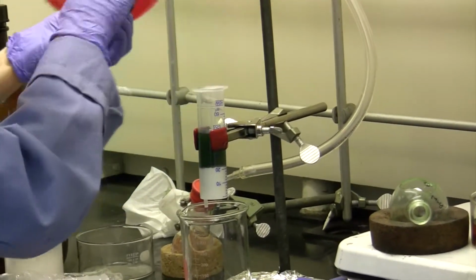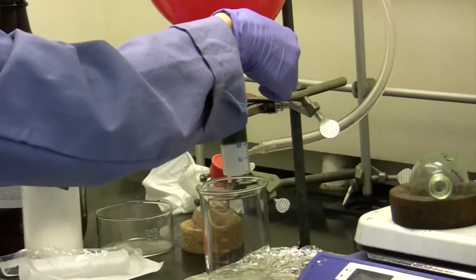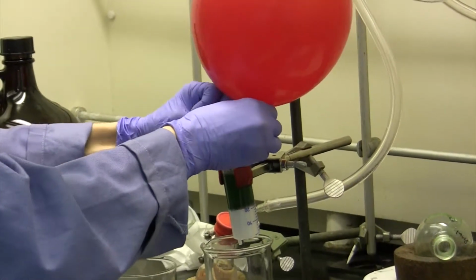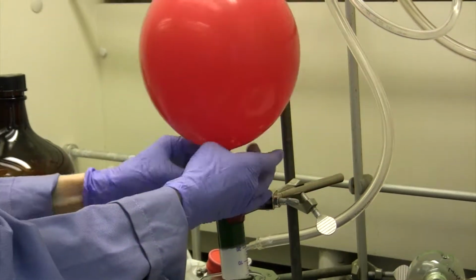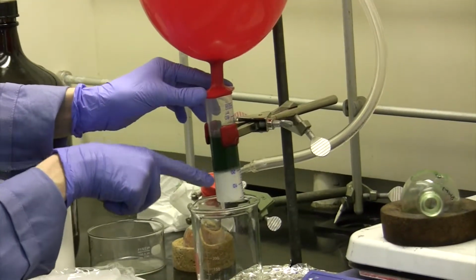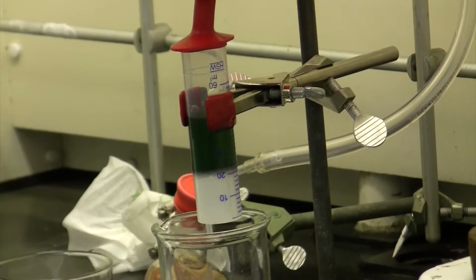And now the one thing that you want to be sure with this, if the balloon comes in contact with any solvents, it will pop, which can be pretty startling. So you want to make sure that you're nice and careful. There we go. So now you can see that you're starting to push your polymer through the column. And we're just going to wait for the column.